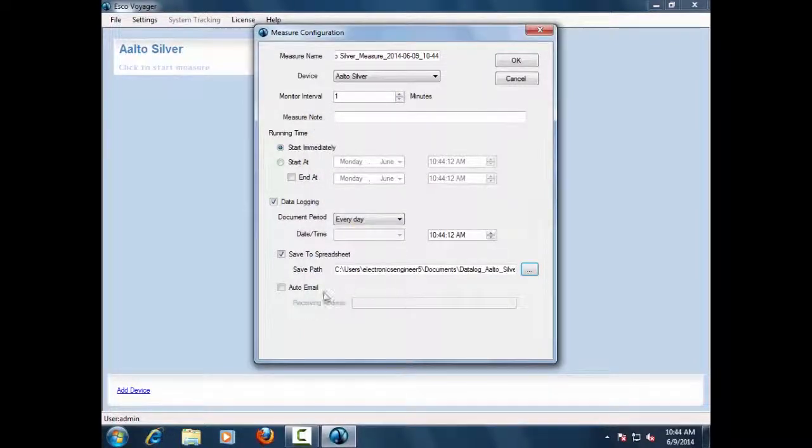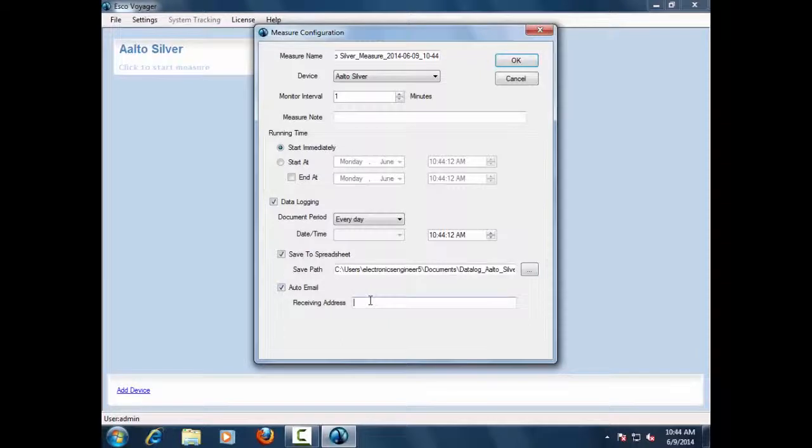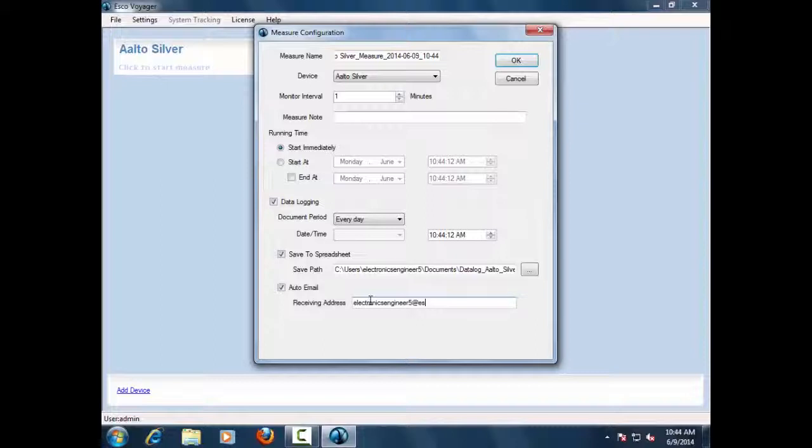Lastly, users can also set up auto-email alerts by inputting their email address.